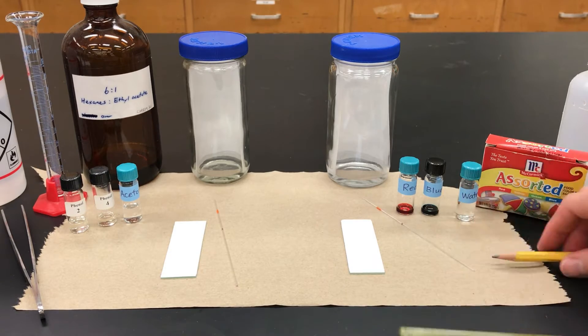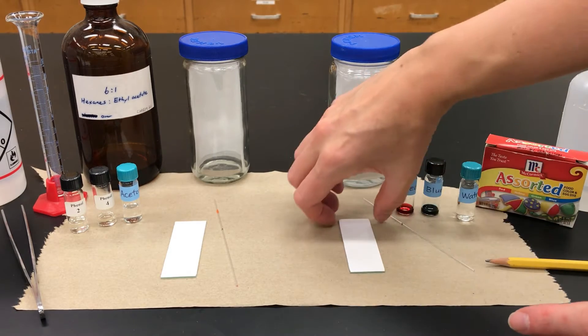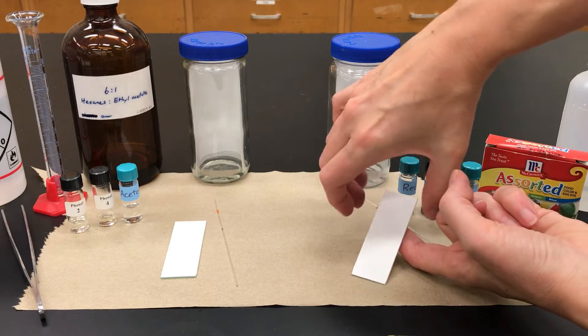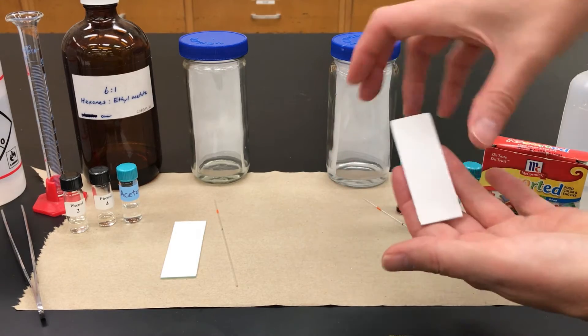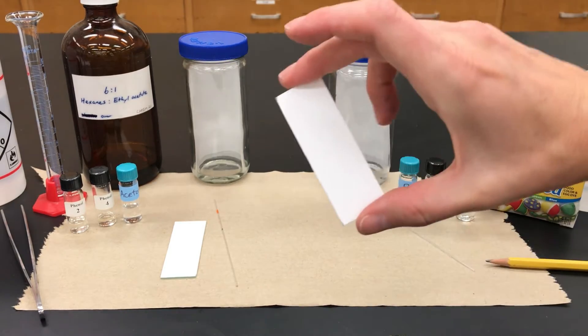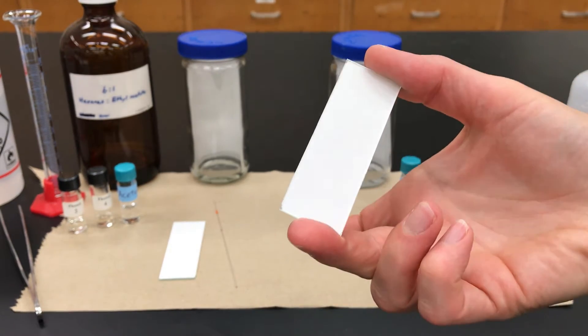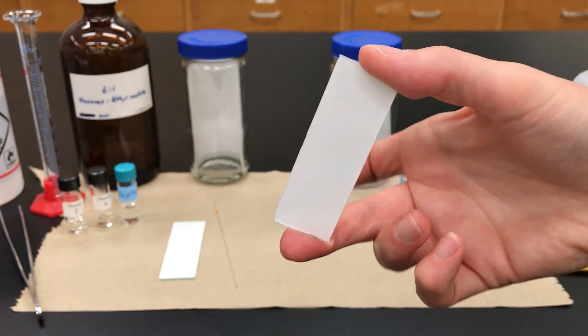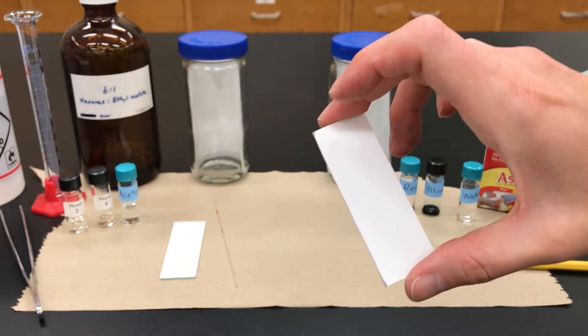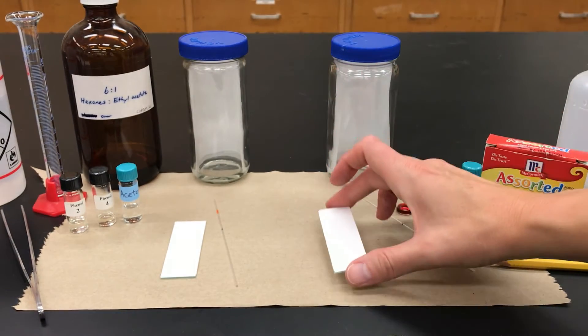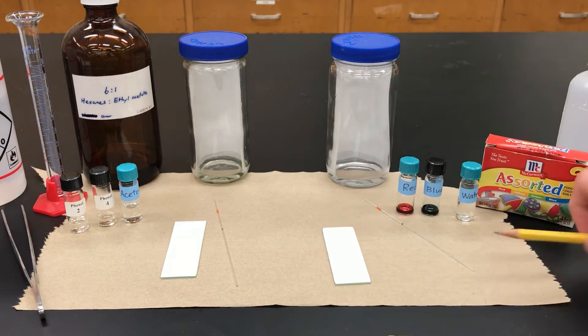Next, I'm going to prepare my TLC plate. The ones that I use are glass-backed and they have a very thin layer of silica gel over the front side. If I move this around, you might see some reflections. On the back is glass, but on the top is more muted and that white part is the absorbent where all of the separation is going to happen.